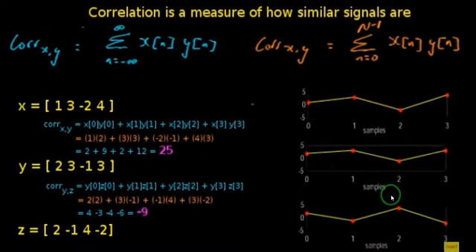So up until now, we just mentioned that based on the information which is encoded within the change of the pattern in the light intensity, we are going to extract the information about the size of the particles.